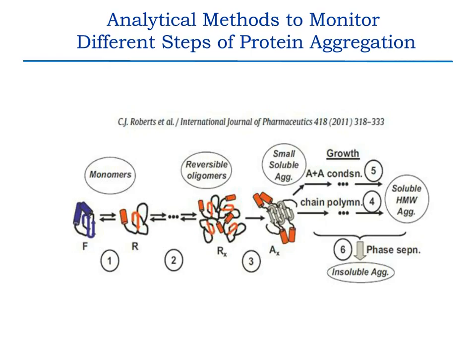be difficult to detect. And then as we go from step 3 to 4, 5, and 6, we move to the formation of small soluble aggregates and larger particles, and these are irreversible in nature. One of the challenges that we have is many of the analytical techniques that I outlined for you earlier in the talk are really focused on these irreversible aggregates on the right-hand side. And we don't have good analytical technology to detect those early steps in 1 and 2.